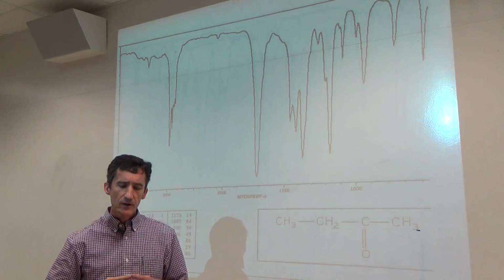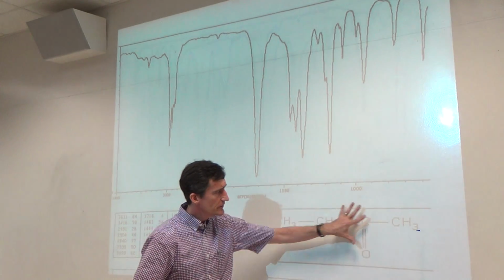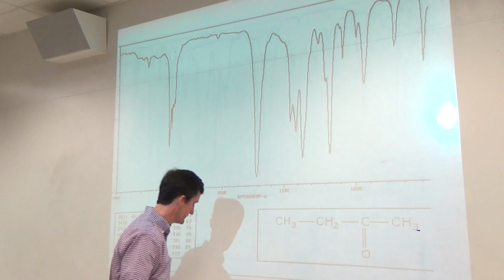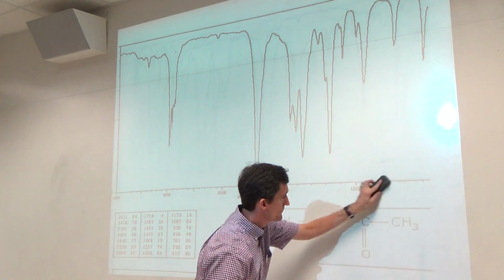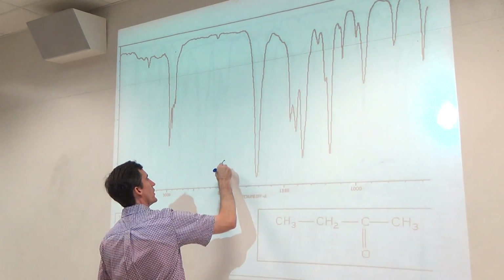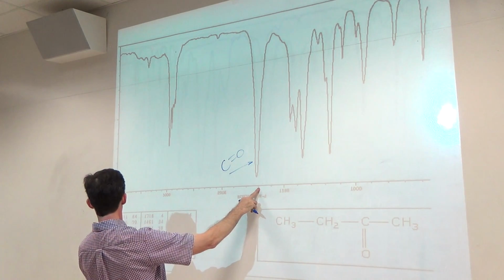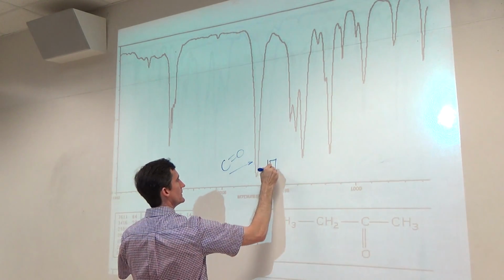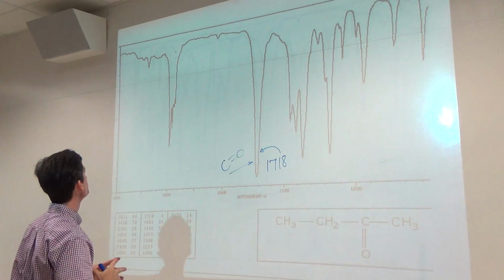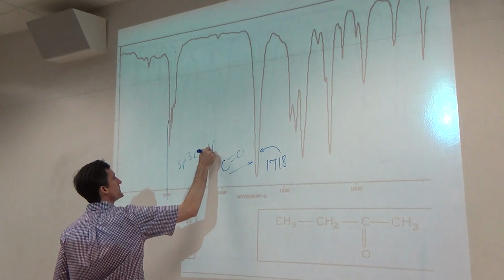Now we'll turn to our functional groups or compounds that contain a carbonyl group. This here is a ketone. Carbonyl bonded to two plain carbons. We can look for the carbonyl. Here we go. A nice carbonyl peak at about 1718. Standard carbonyl range. We have sp3 CH.